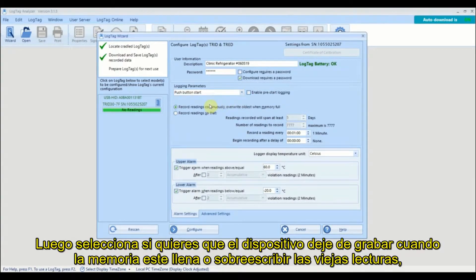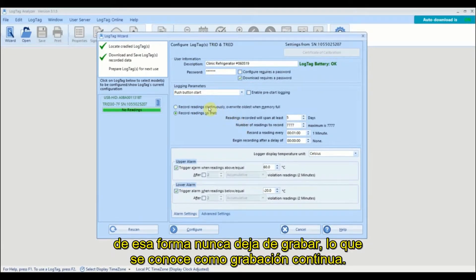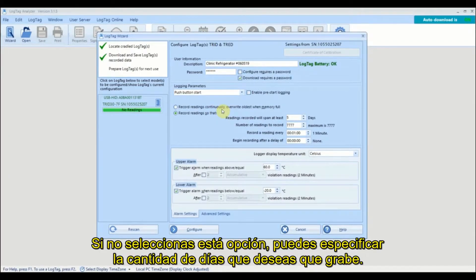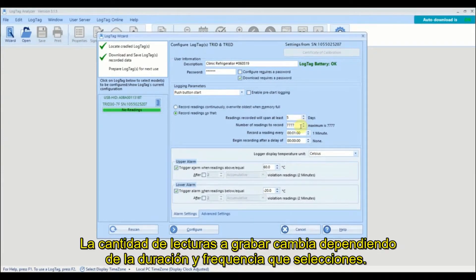Next, select whether you want the logger to stop recording once the memory is full or to overwrite the oldest reading so logging never stops — this is called continuous recording. If continuous recording is not selected, you can specify the number of days you wish to record for. The number of readings to record is changed according to the duration and frequency of your readings.